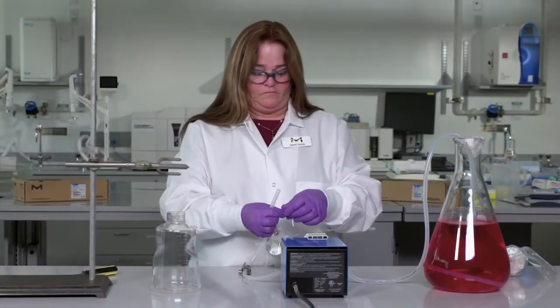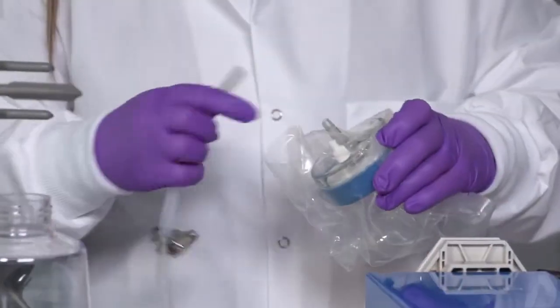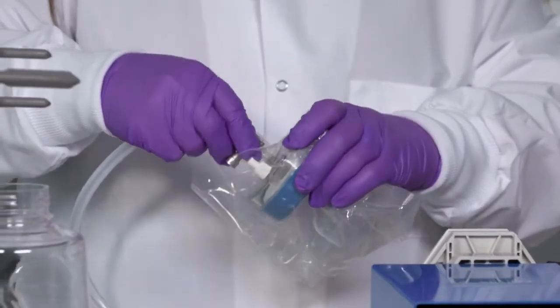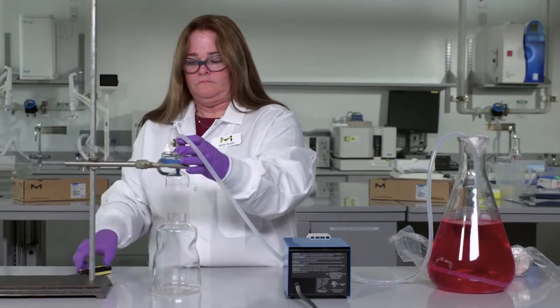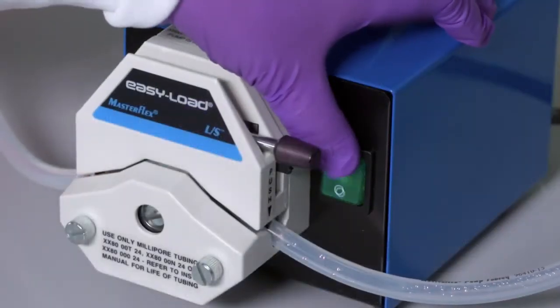Peel open the Steripak GP filter package container using aseptic technique and attach the tubing to the inlet using aseptic technique. Remove the unit from the blister pack, connect the unit to a ring stand, and place a sterile collection flask under it. Turn on the peristaltic pump.